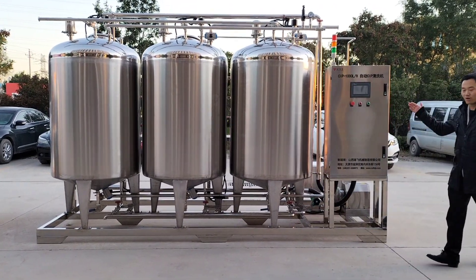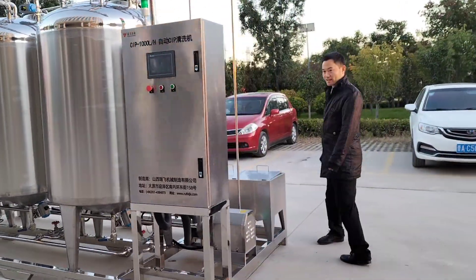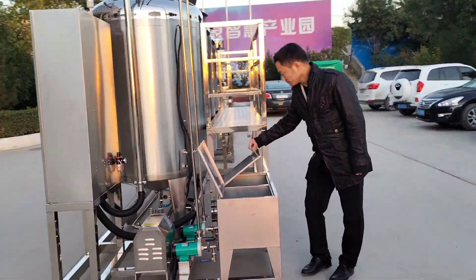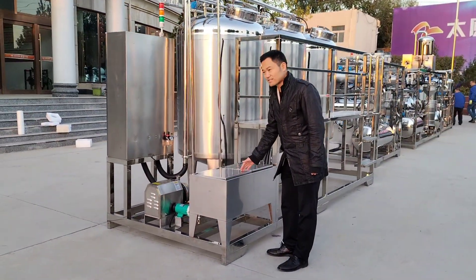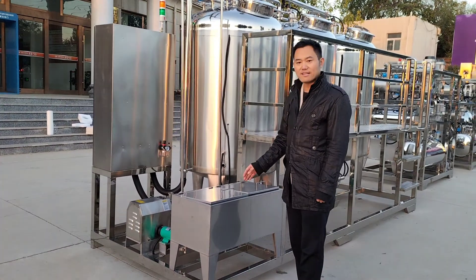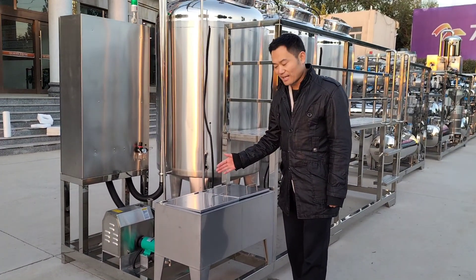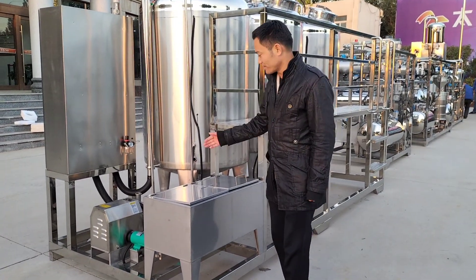Here, behind this machine, we can see there are tanks. These two tanks are made from stainless steel 316. It is for strong acids and strong alkaline.